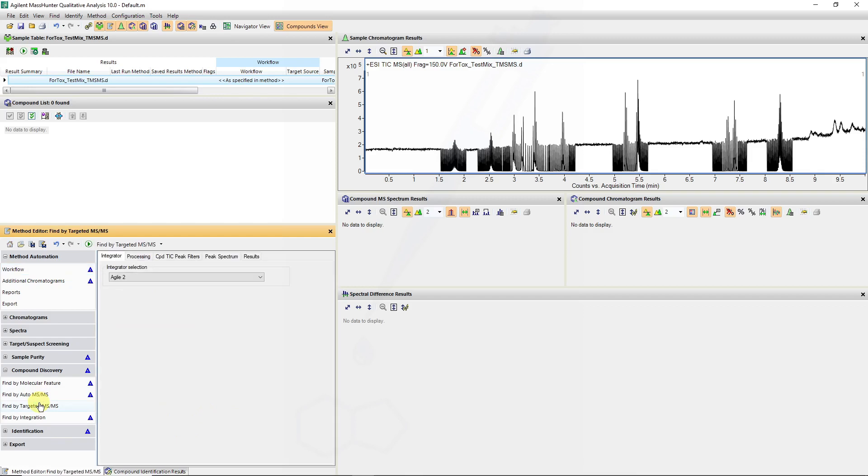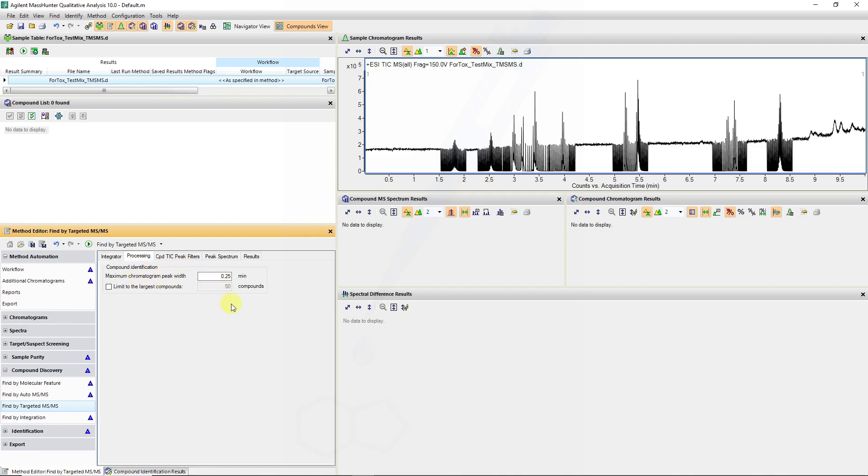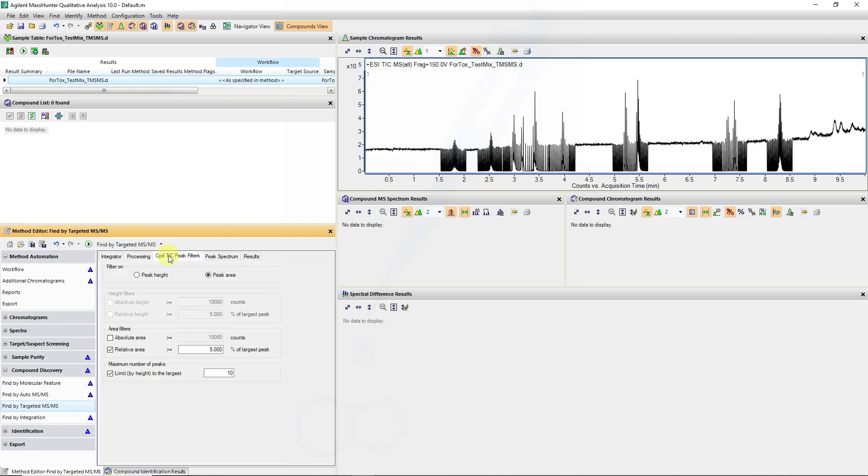In the find by targeted MS-MS you might see new parameters. We will use the Agile 2 algorithm. Some of these chromatographic peak widths come from the targeted list but that's dependent on your peak widths. And for the compound total ion chromatogram peak filters I will keep the default values.